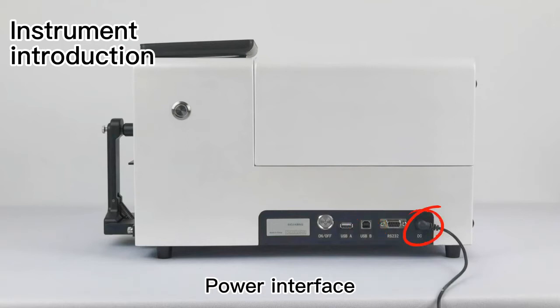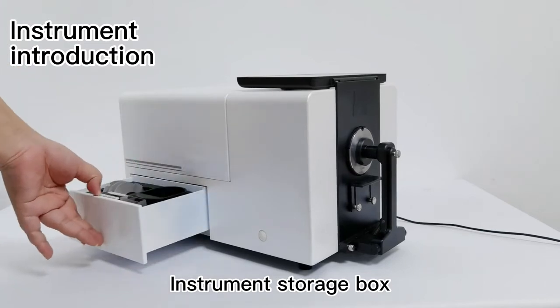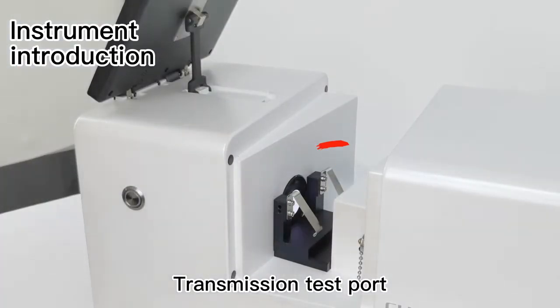Interface features include liquid crystal display, reflection measurement port, instrument storage box, and transmission test port.